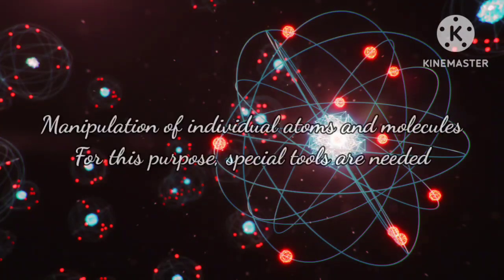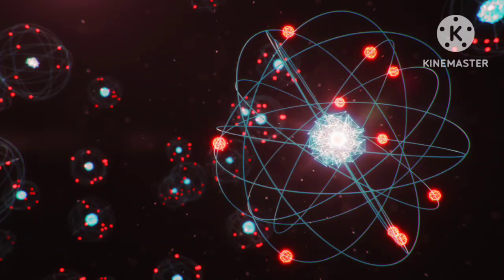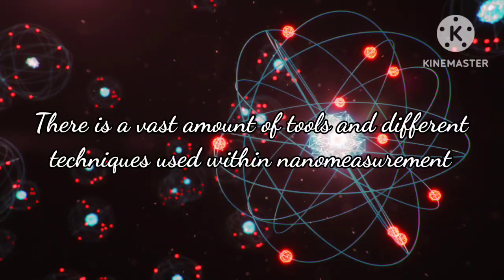Now think about manipulating materials at that scale. You need to be very accurate and precise to work at such small scale. For that you need special tools and instruments to manipulate objects at nanoscale. There is a vast amount of tools and different techniques used within nanomeasurement, each with a unique means of helping us understand a material.